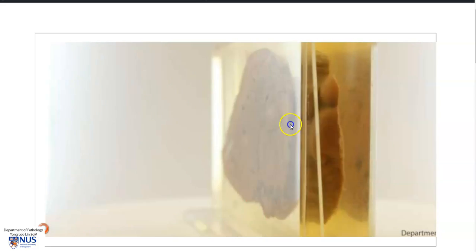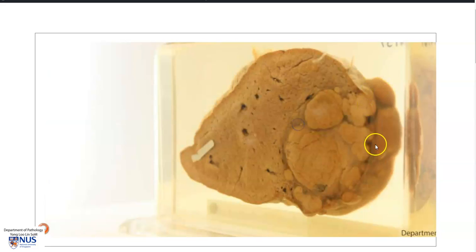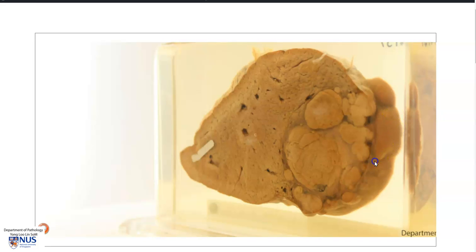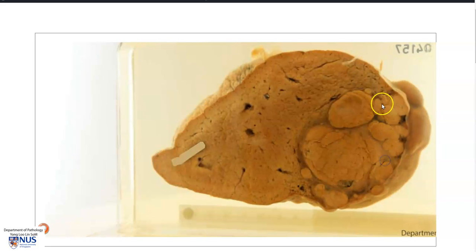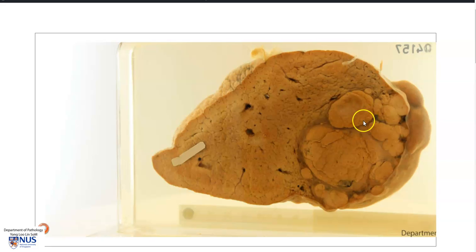The mass protrudes out of the liver capsule here, causing this distorted nodular appearance, and on the opposite surface you can see that it is fairly lobulated, very fleshy, and tan in color.